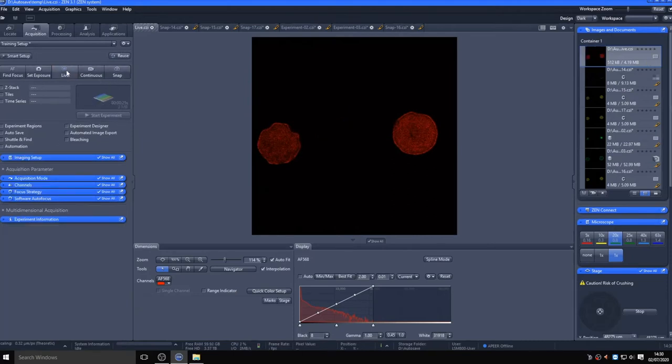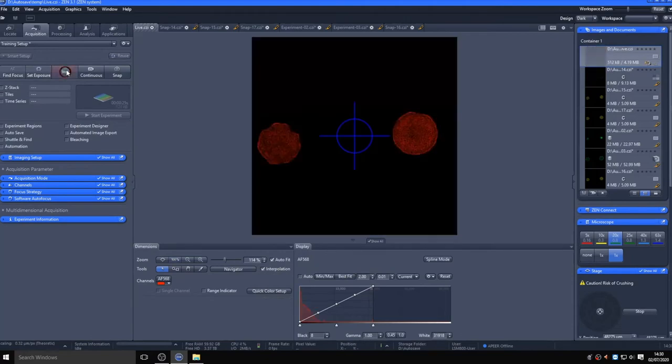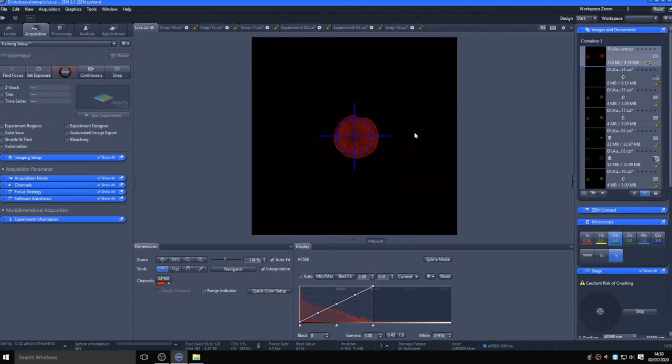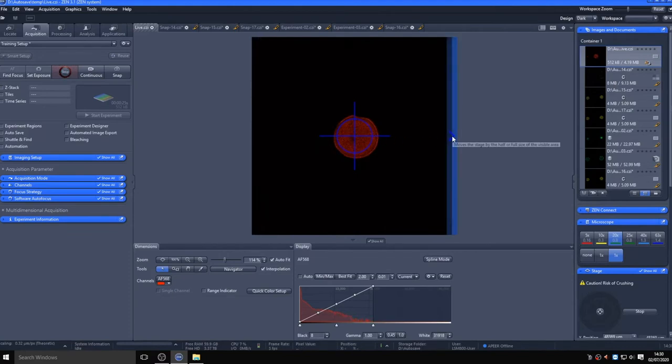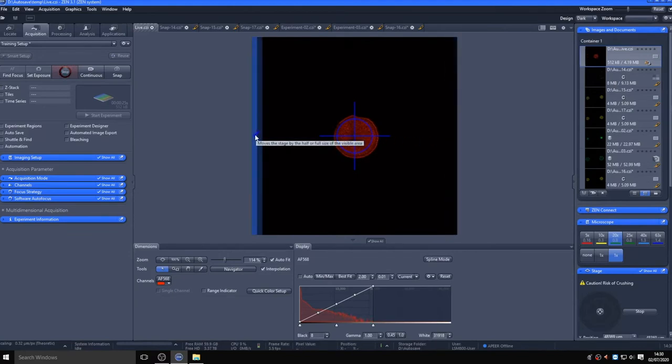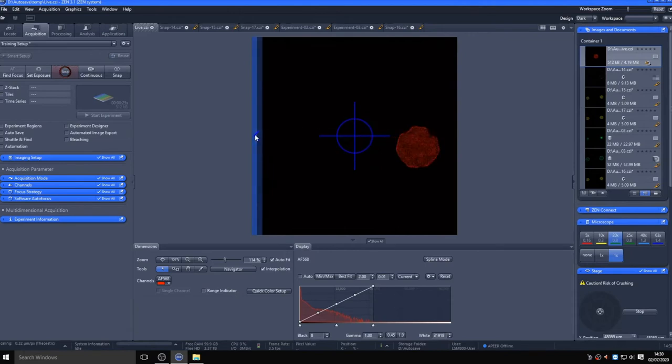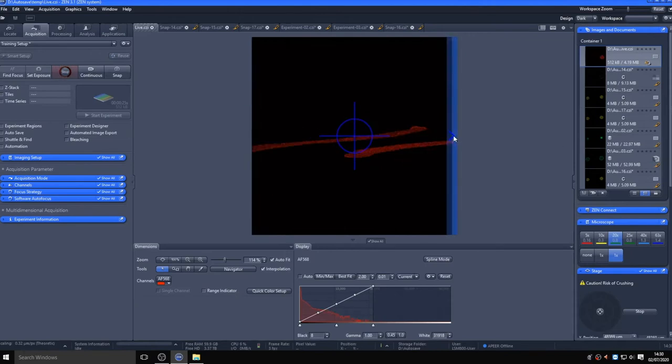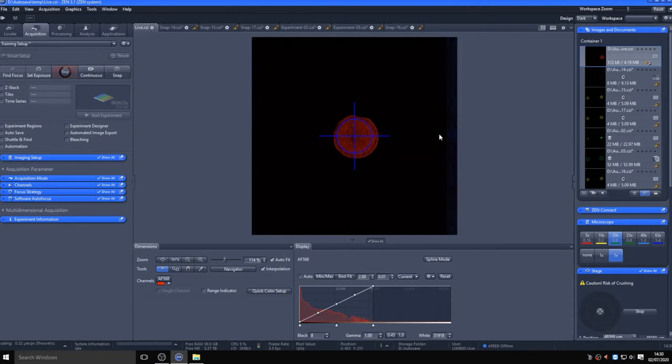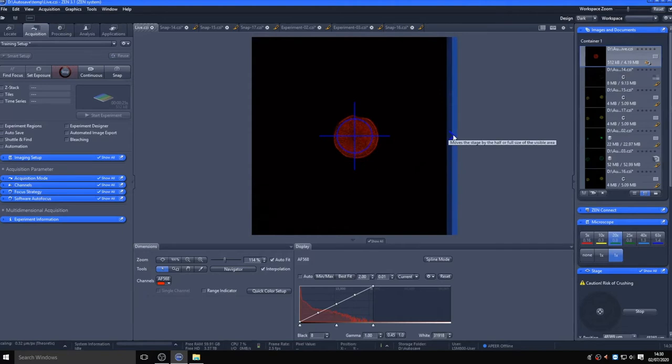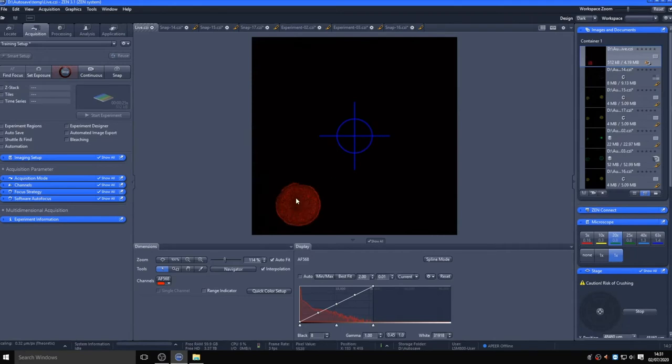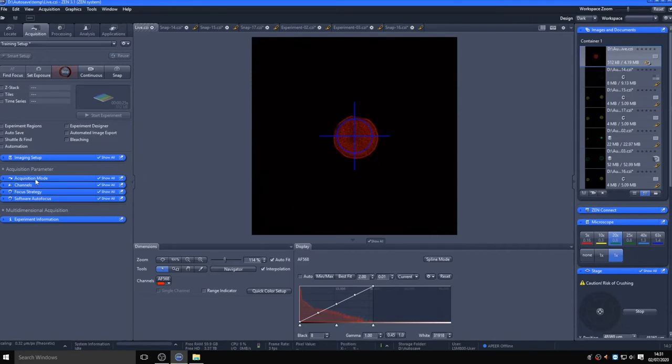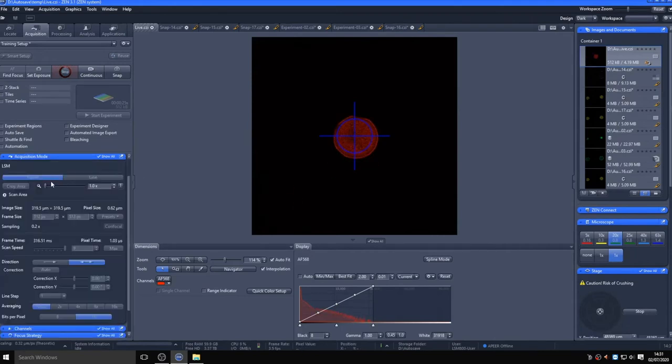We will now move on to the tiles and positions capability of the system, so click on the tiles box. If I go back live onto my image, I can move around the stage, either using the joystick or using the on-screen controls. Double-clicking on the live image will re-center on the crosshair, and clicking on the edge of the image will move the stage by half or a full field of view in that direction. There is also a virtual joystick in the right-hand controls panel.